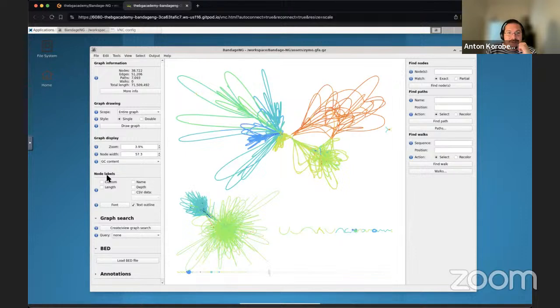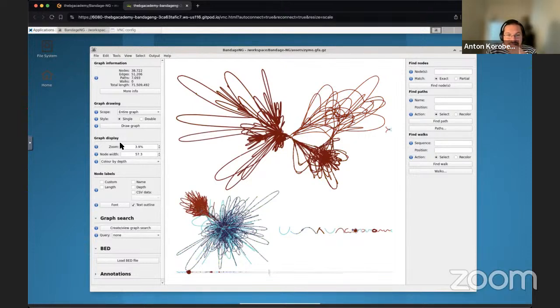So we can also see how the graph goes by depth. In the bacterial part, pretty much everything has similar depth, but in this part, we definitely see two different pieces, having pretty different depths, maybe even 3 different pieces.